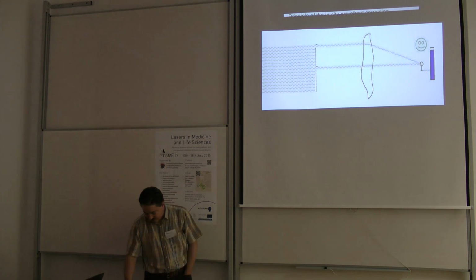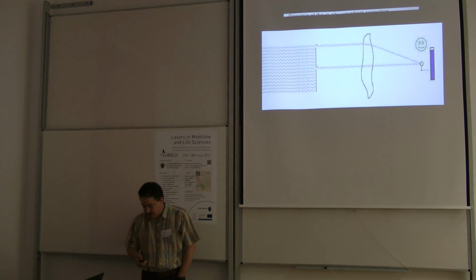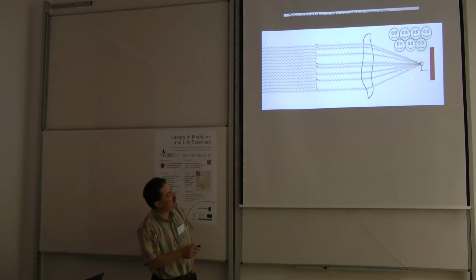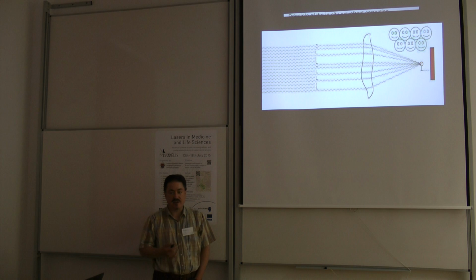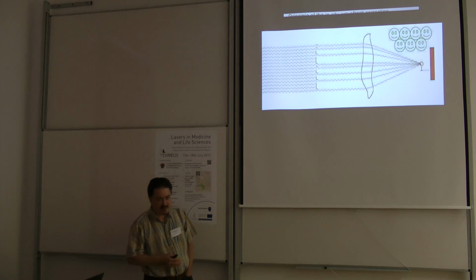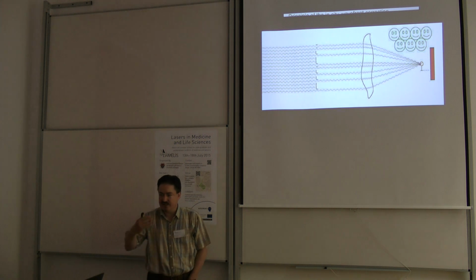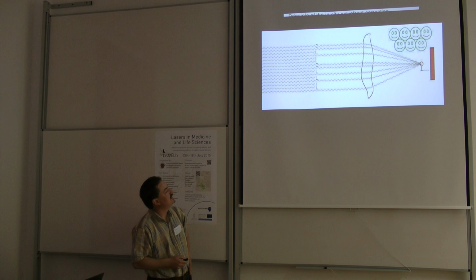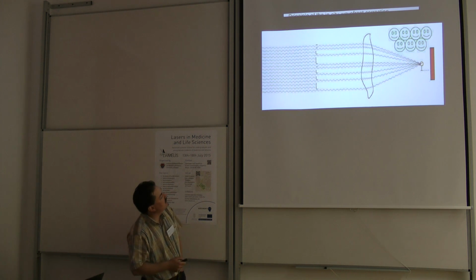So after that, when the system is fully scanned, I can just open all the ones that are the good guys, and you can see I got all the beams in phase. But because I have a phase modulator, I can do more than that. I can actually shift the bad guys a little bit forward, which you will see in a bit.